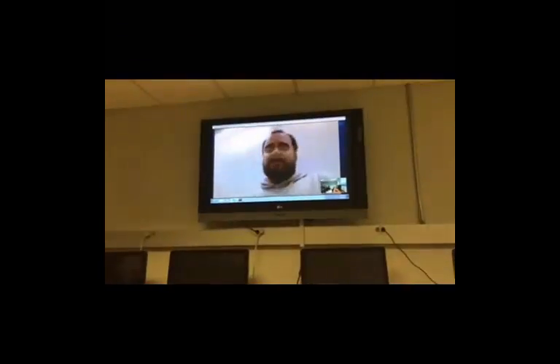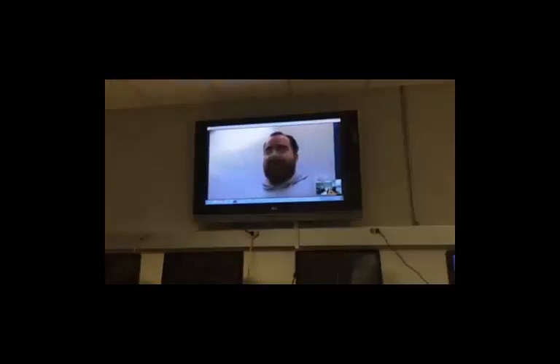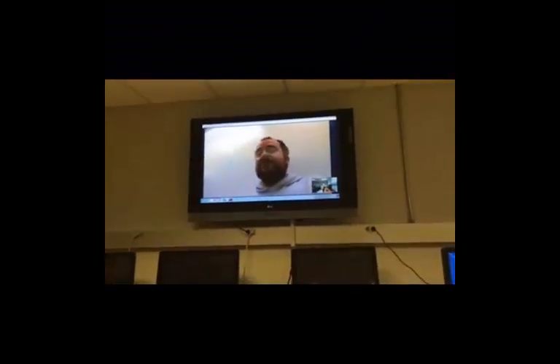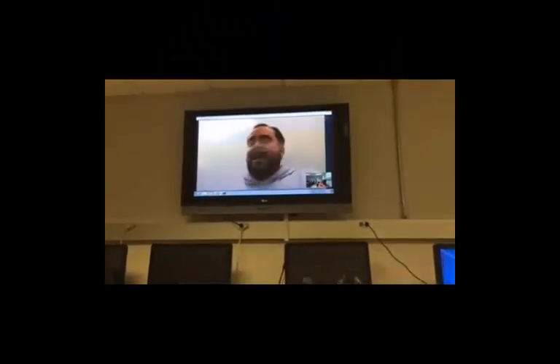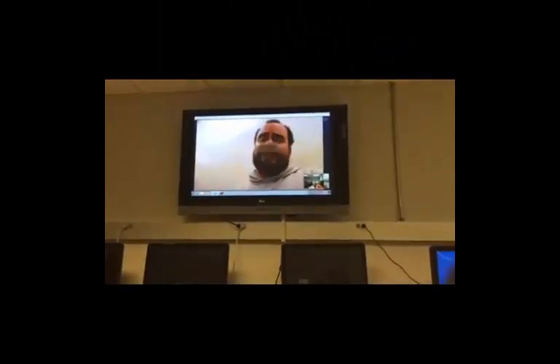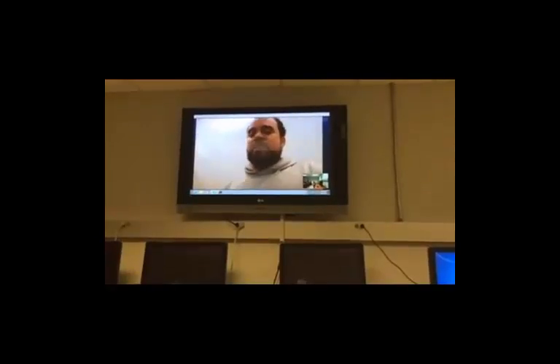So we're hoping today to show you exactly what would happen if you were here on campus at Dominguez Hills, to actually run your samples and get the data. Of course, one of the advantages is that you don't really have to be here to monitor and watch the data being collected. That just takes 15 minutes tops.